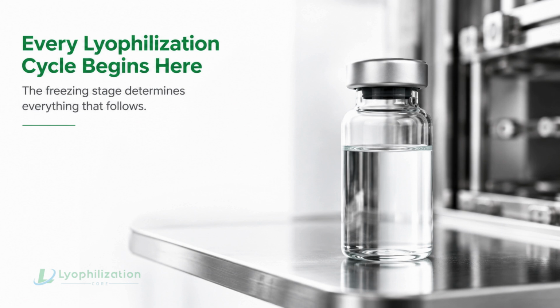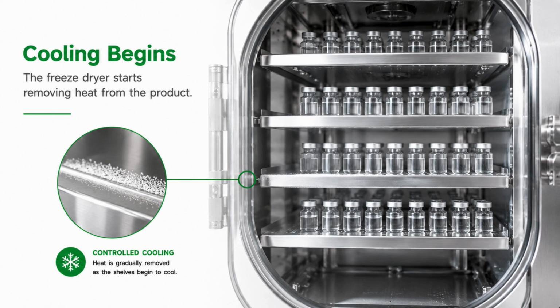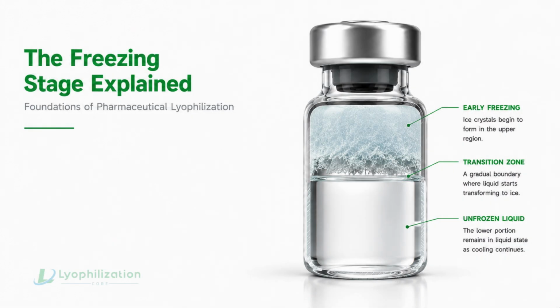Every successful lyophilization cycle begins with a step that is often underestimated: freezing. Although it may appear to be a simple cooling process, freezing determines the internal structure of the product and directly influences drying efficiency, product quality, and the success of the entire lyophilization cycle.